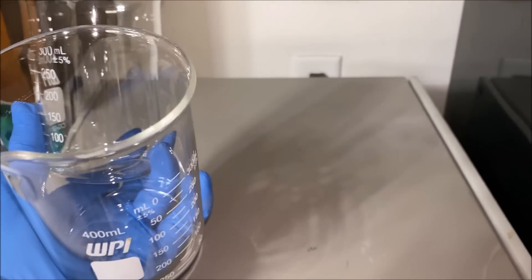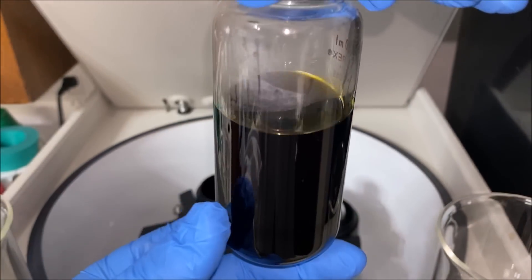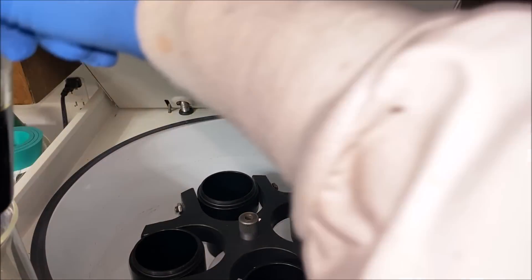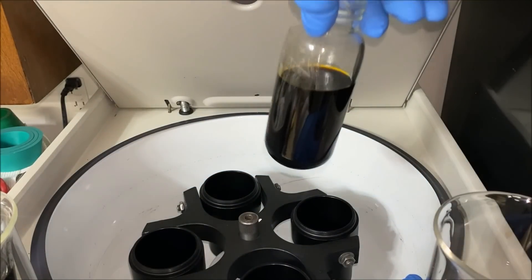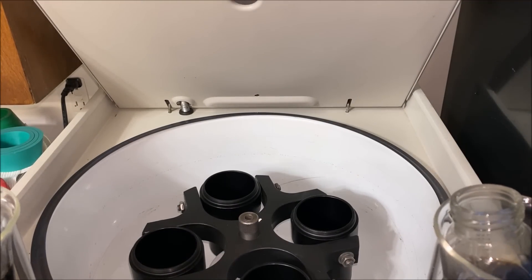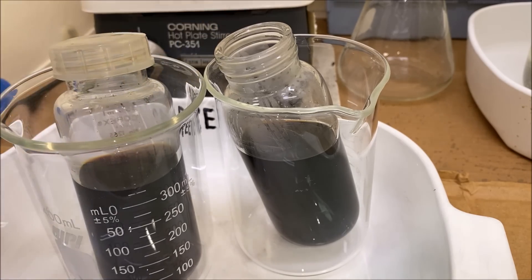Let's see if we've got any of this stuff settled out. Absolutely not — just like I predicted. It's such a fine material, it's like trying to get the black to settle out of ink. This was a fail. I didn't think the centrifuge was going to do anything for us, but I figured we'd give it a shot.